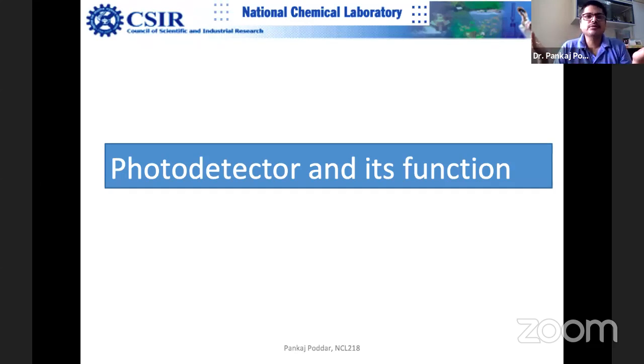Even analysis comes with age. Everybody is improving their analysis, but at least your connectivity with the instrument matters: how the detector is being cooled, whether you're cooling it properly for noise reduction, what kind of lasers you're using, what the wattage of the laser is, and what that wattage can do to your sample, whether it can damage it. Otherwise you may be shining a 20 milliwatt laser onto your sample and exposing it for a longer time, and you may end up getting a crack. You may be permanently damaging your sample.